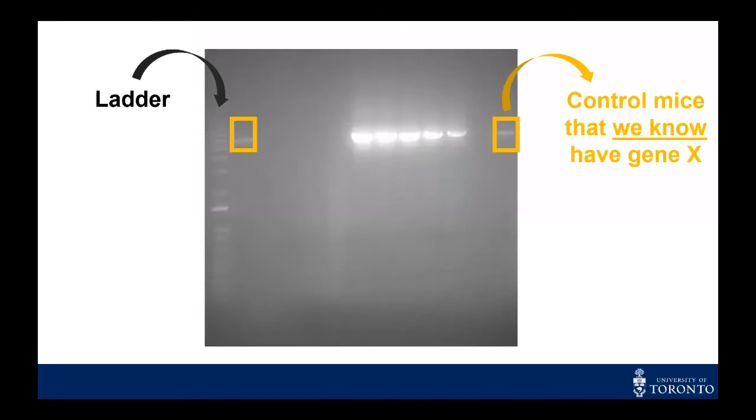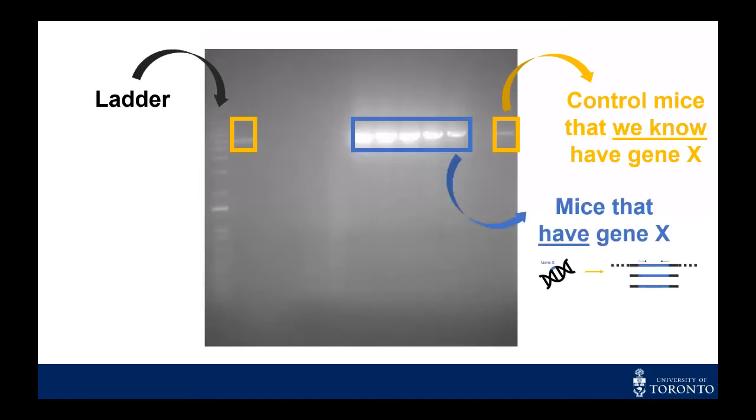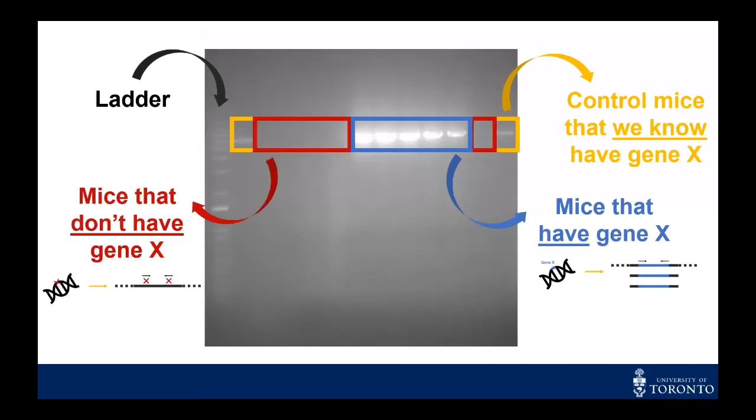In the first lane, we have the ladder. This gives us an idea of the sizes of our samples. Here, highlighted in the yellow boxes, are samples of control mice that we know have GeneX. Next to it, we see some samples that have the same band. These are mice that have GeneX. And on the left, there are lanes without any bands. This shows that these mice don't have GeneX. Now we know which mice don't have the gene and which mice do. This means that we can do tests on these mice to see what happens when GeneX is gone. This will help us figure out what GeneX does.